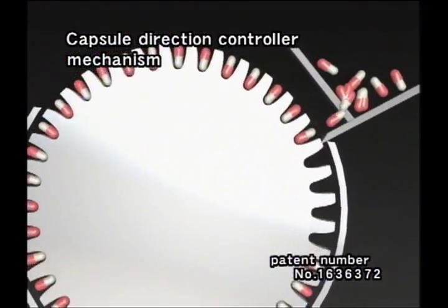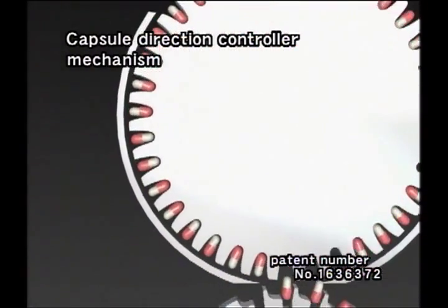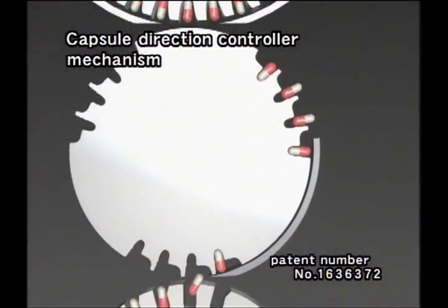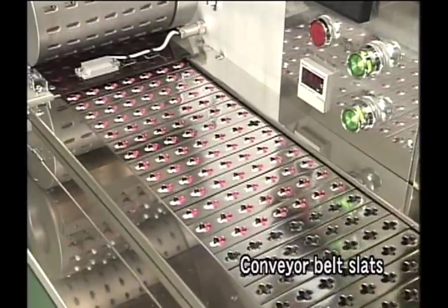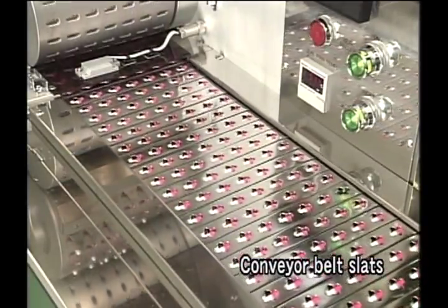QualiCaps has a patented orientation controlling mechanism that permits the orientation of even filled capsules to be rectified and stabilized without applying any pressure to the capsule. The capsules which have been rectified are continuously fed into the pocket of the conveyor belt slats.